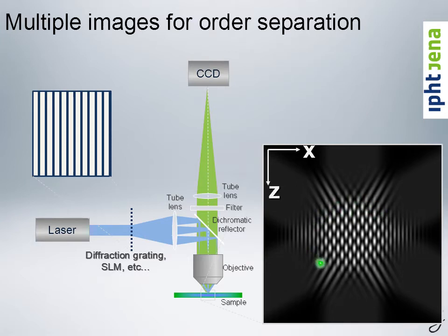So you get this sort of three-dimensional lattice, if you want, of illumination patterns. And this three-dimensional lattice is actually a bit like a woodpile structure. If you had a pile of wood, put it again onto itself and so on, it looks like this. So this allows you to also gain resolution along the Z direction when you perform the whole thing.